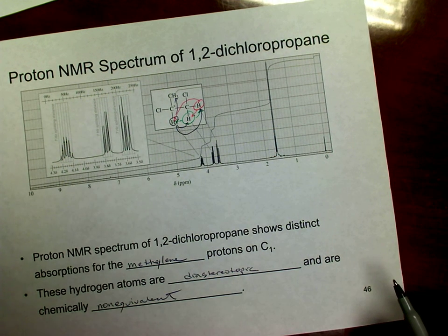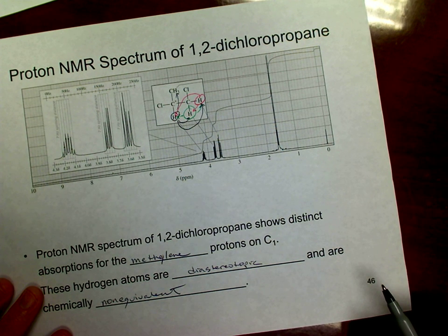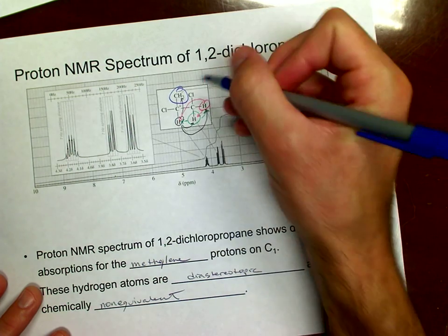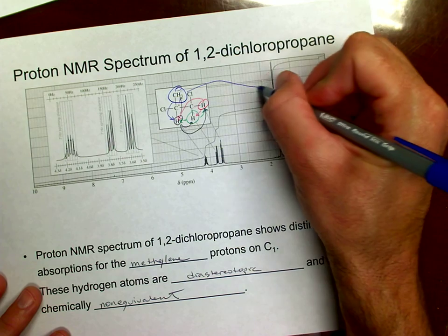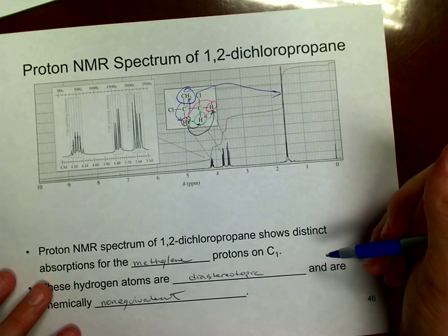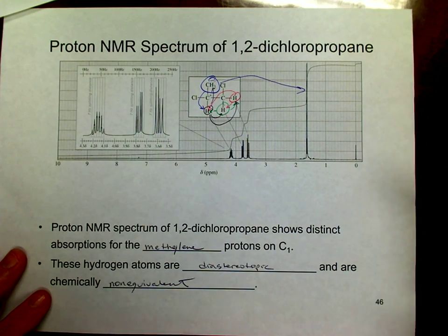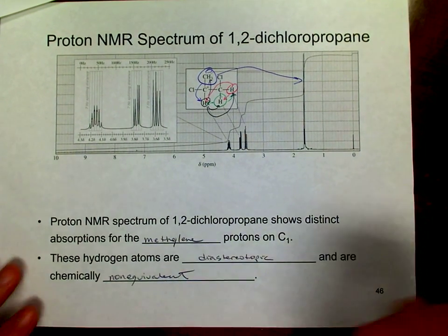Okay, so that's it. I guess I could have done the methyl: these 3 only see 1 proton, and so they're a doublet. I guess I could have done that too. That's all of these slides for NMR spectroscopy. All right.